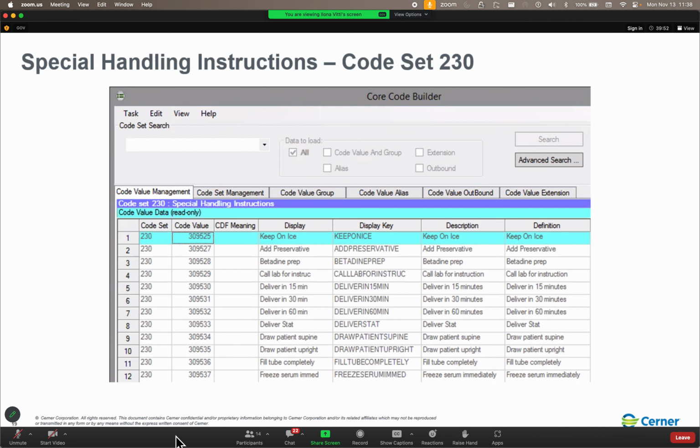All right. Now, remember this other tool I was talking about, though, that associates benches and instruments to collection classes? Oh yeah, this one I like. Because what this one says is that if your order routes to the Chem Auto subsection, Chemistry Manual Bench, VTROS 1, VTROS 2, whatever, we're going to default in the Chemistry collection class. So, folks, that right there will save clicks, which saves time when you're doing your build, and it also gives a more consistent build.